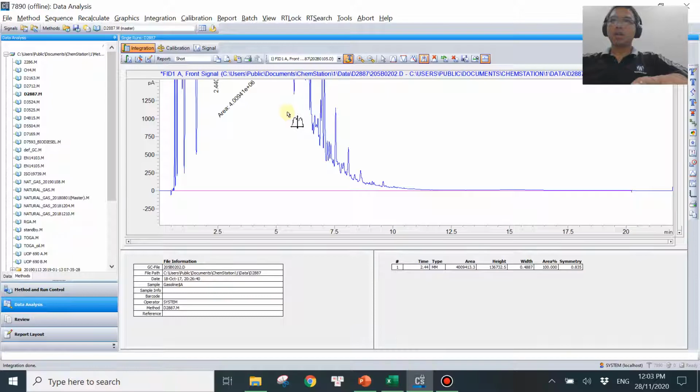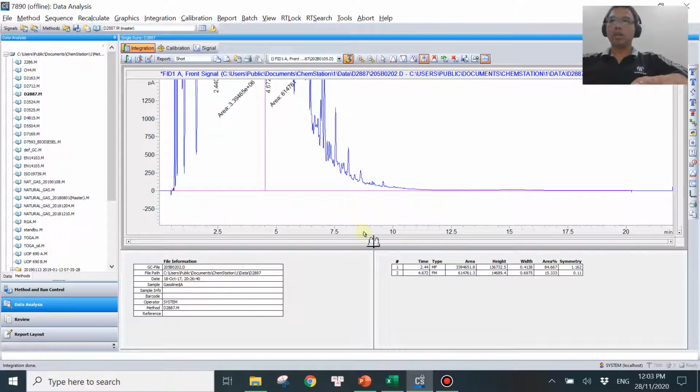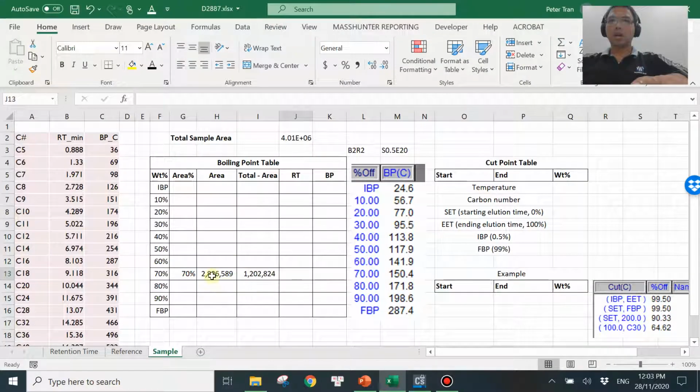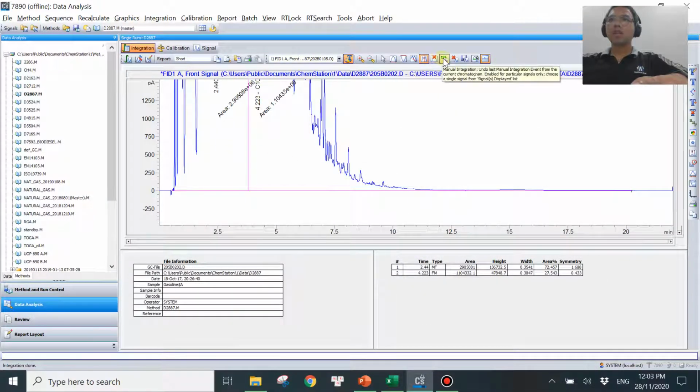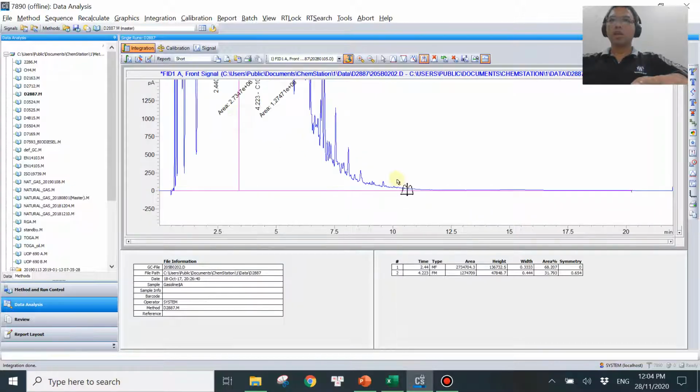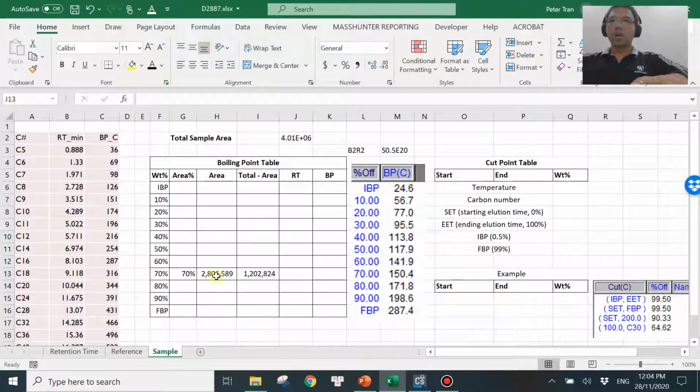Okay, so because just now it was a little bit too much, I want to go back a little bit here. That will give me 3.3 million. So that's still a little bit too much. Remove, go back somewhere here. Now I get 2.9, so getting closer. Now I need 2.8, right? But here is 2.9, so that's a little bit over. Then remove again, go back somewhere here. That is 2.7, so that's quite close to this one.